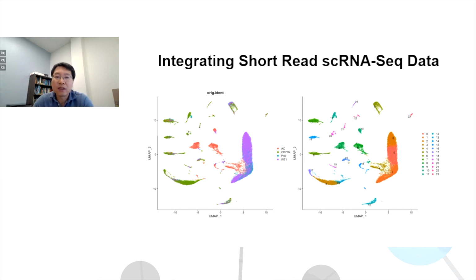So looking at the cell clustering, we look at the single cell sequencing from short reads, and as you can see, the different colors correspond to different samples. As I mentioned, the 2 samples from wild type aggregate together here, like this part. These 2 go together because that's what we expected. And the other 2 samples, which represent different cell types, separate differently. This is just looking at cell types and clusters, and you can see that's what was expected.